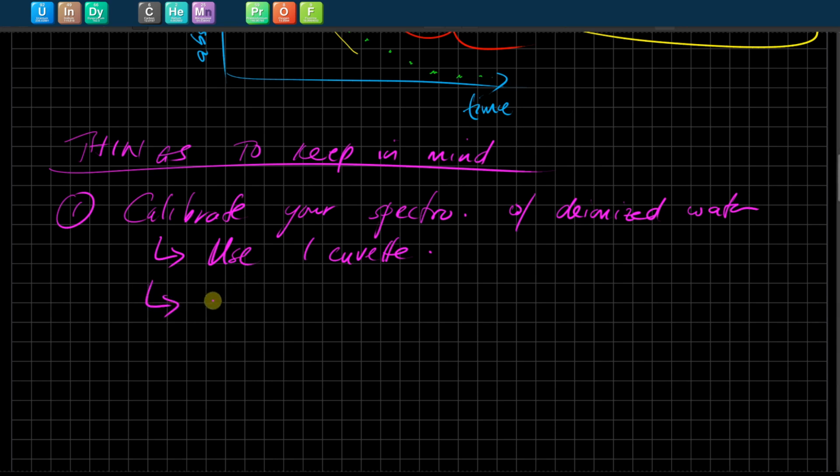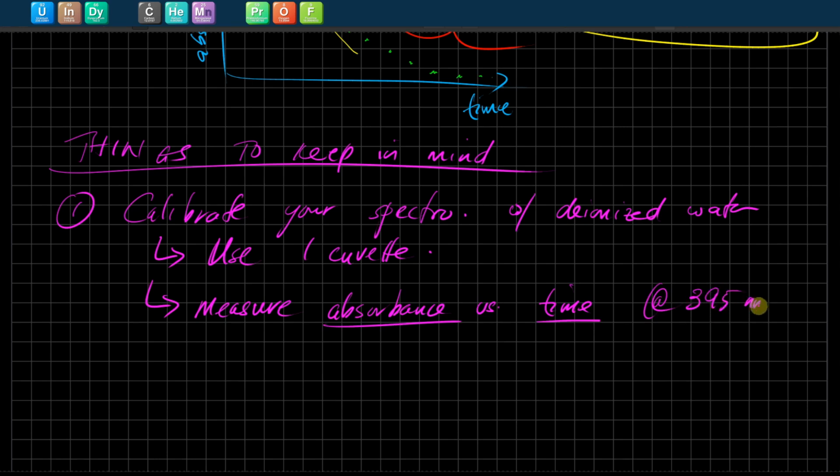What we want to measure is absorbance versus time.